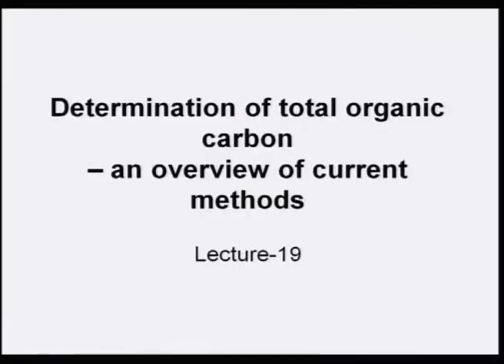Now, another aspect is the determination of total organic carbon, and how this method is viewed in the whole scenario is also very, very important for a chemical analyst. So, I thought that I should dedicate a part of the lecture to explaining what is total organic carbon and how it can be determined.